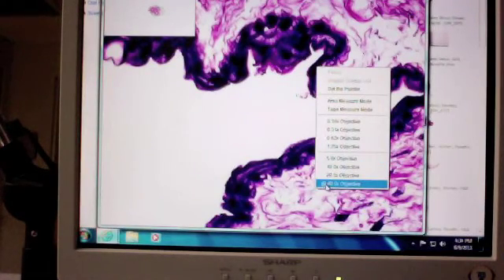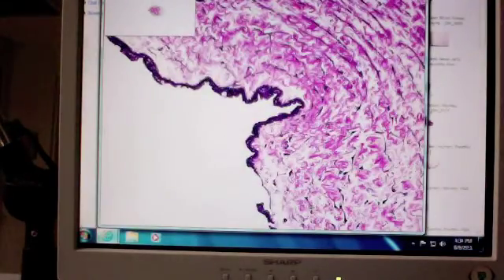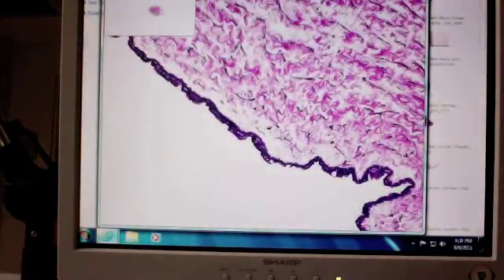But remember, we can actually see all the collagen fibers here, although technically when it is fully saturated with water, we should not be able to see those collagen fibers. During the processing, we've taken all that water out, so this umbilicus has shrunk tremendously. So those nice flat mesothelial cells that we would have had on the outside surface have all collapsed together, right?